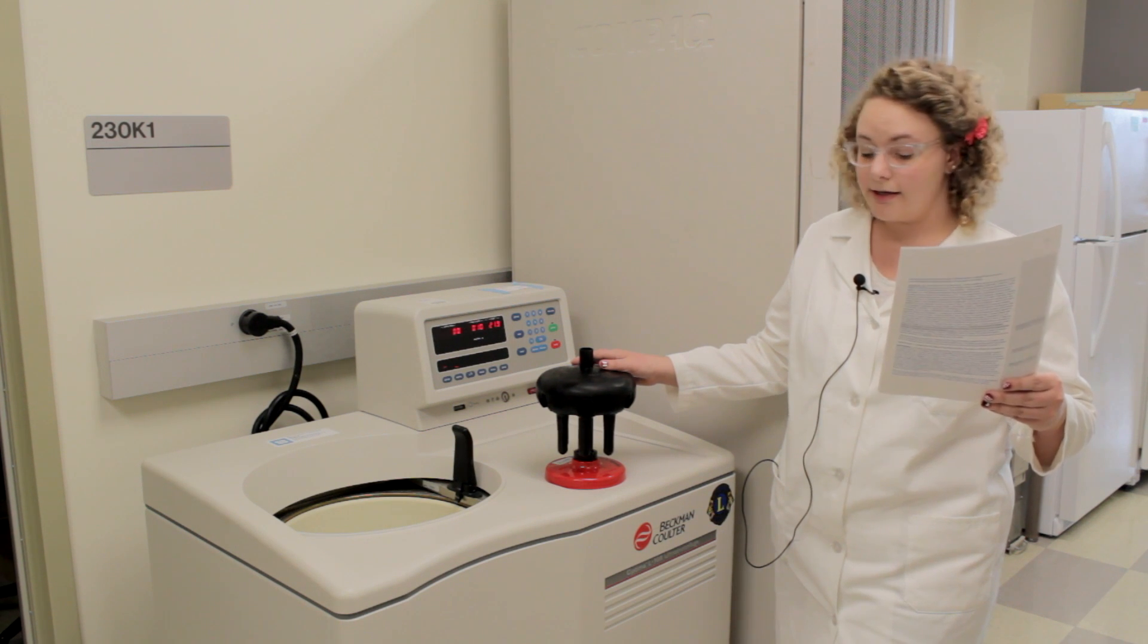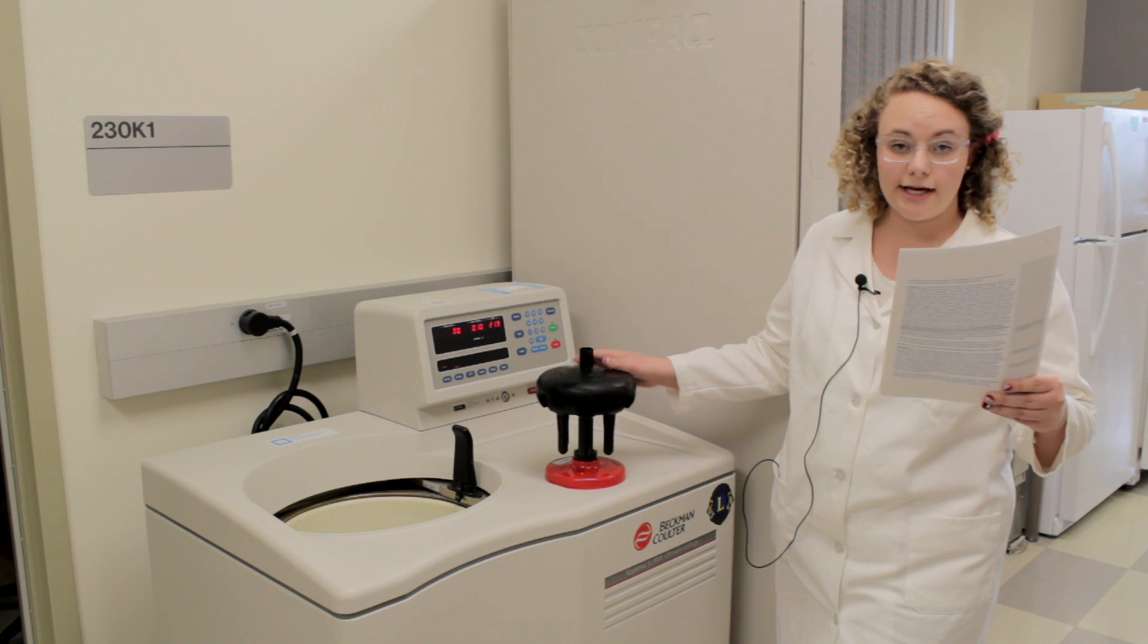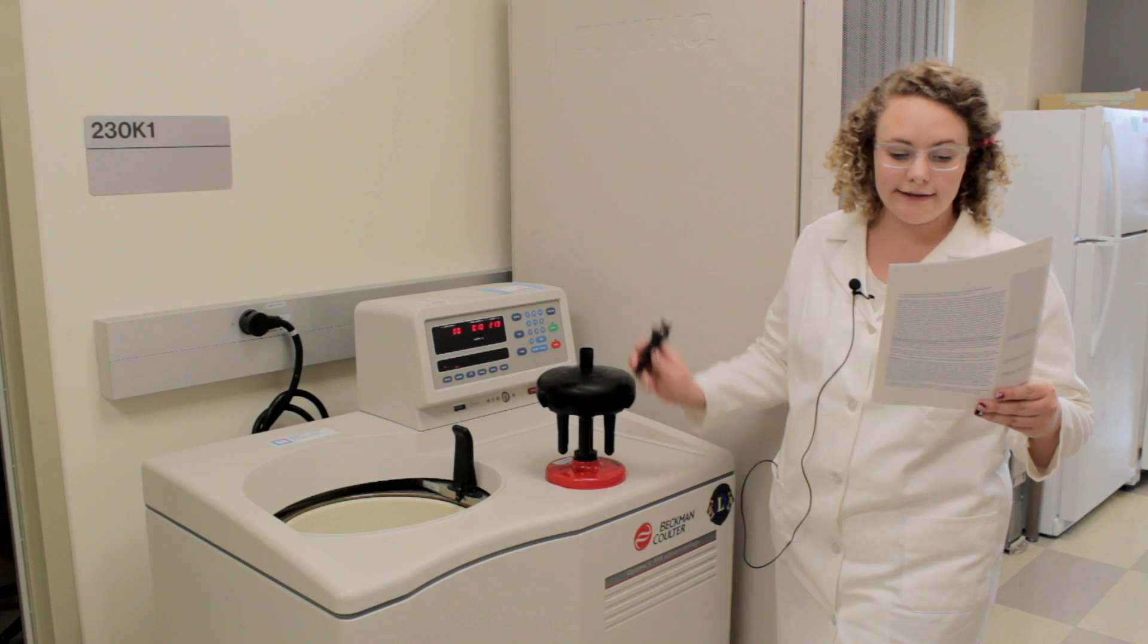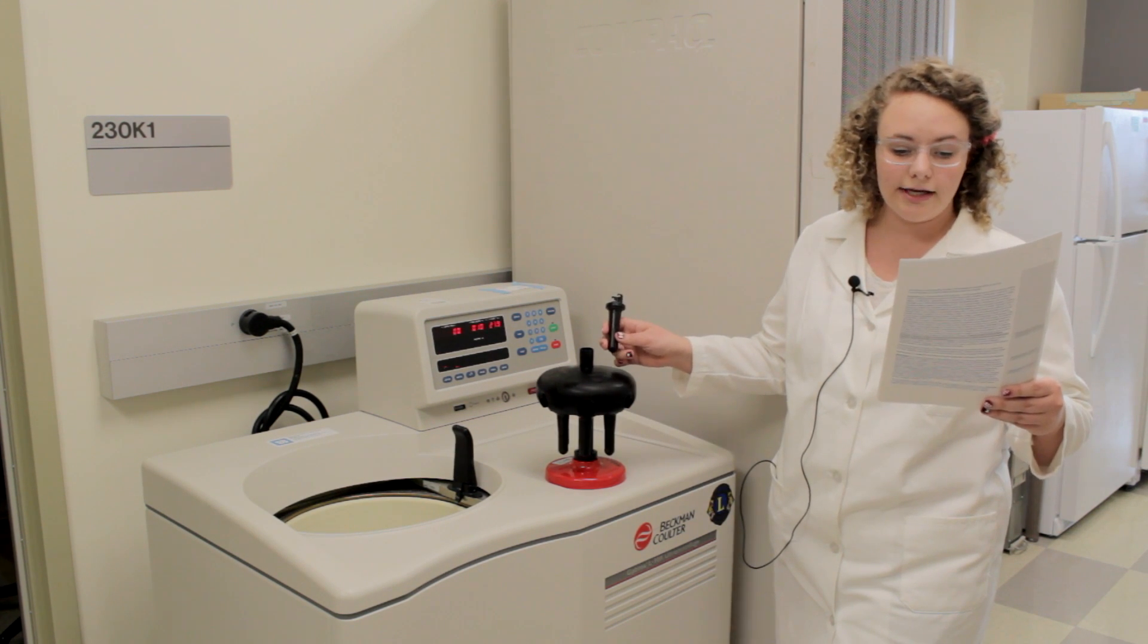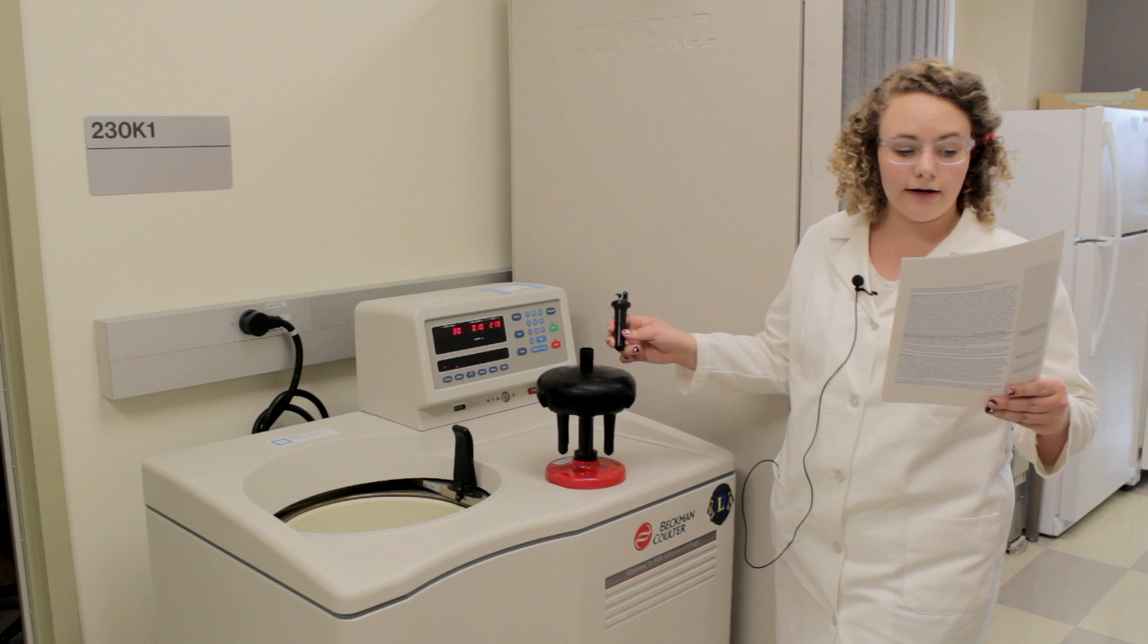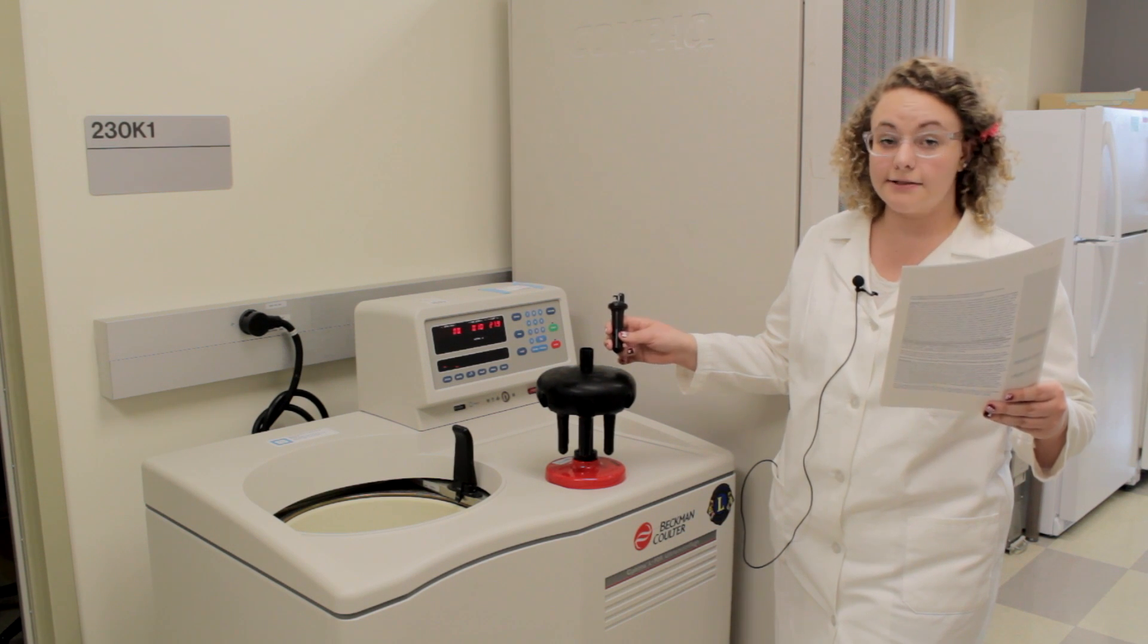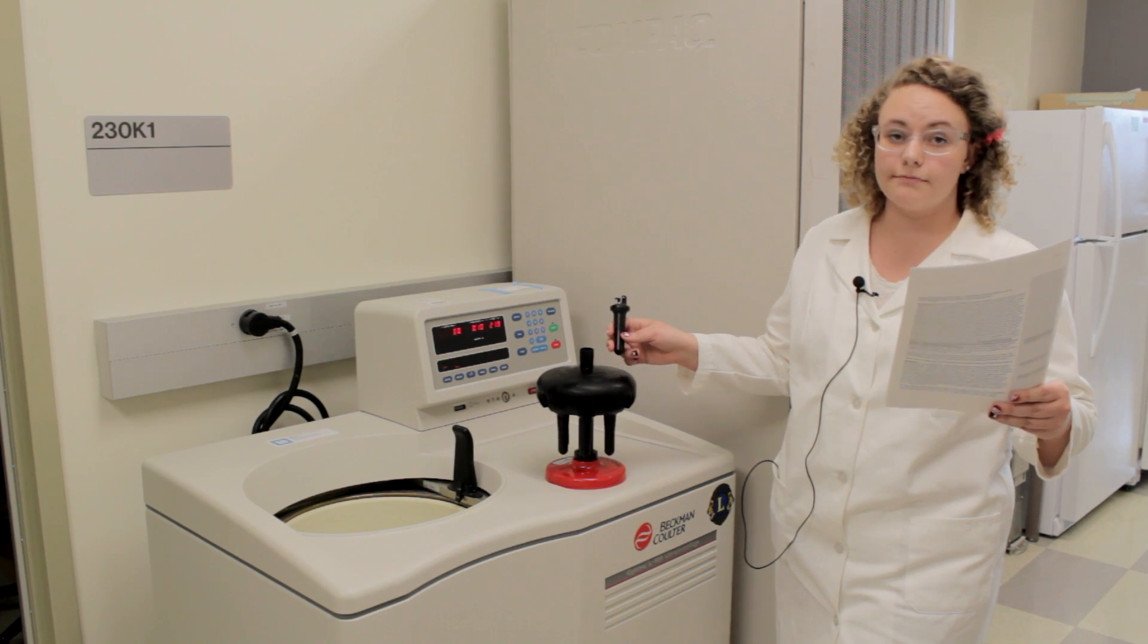Using the ultracentrifuge is extremely dangerous. Each test tube that you put in the centrifuge has to be measured exactly the same. If not, and the centrifuge is unbalanced, it has the power to take out entire floors and buildings.